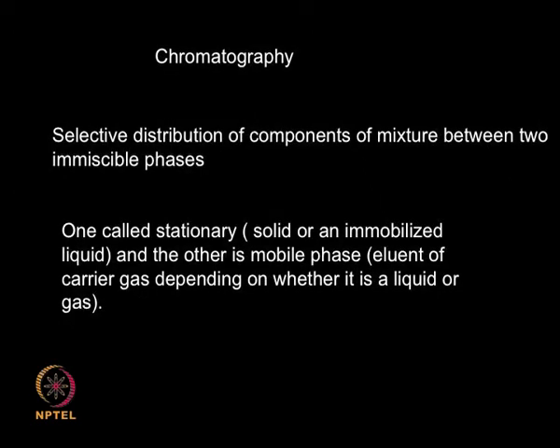So what does it do? Basically, a solute gets distributed in the continuous phase as well as in the stationary phase. That's what happens actually. This distribution happens because of many factors, whether it's partition, ionic forces, hydrophobic forces, or certain types of ligands selectively binding certain proteins. So many different forces may be leading to a separation of a solute from the continuous phase. So the various components, or a mixture of proteins, get separated because of these different forces.